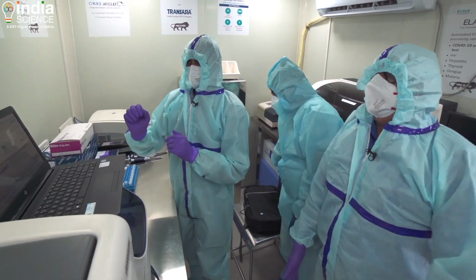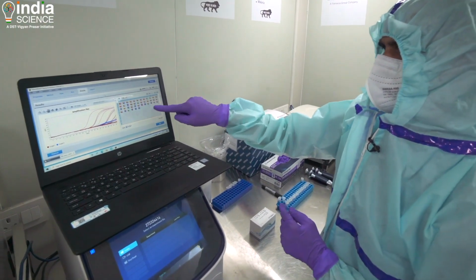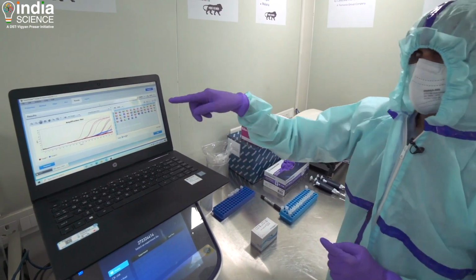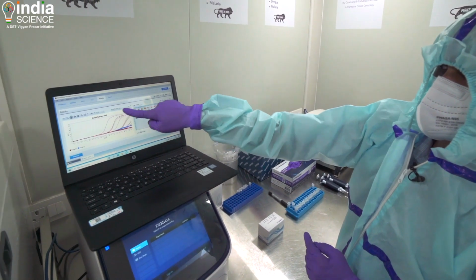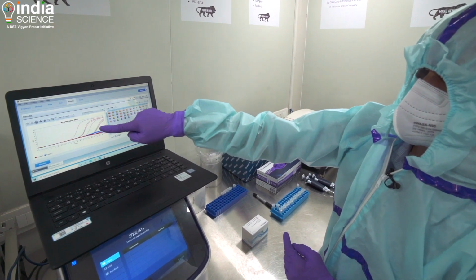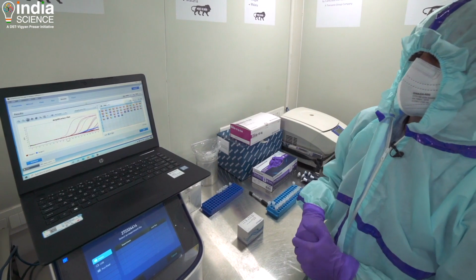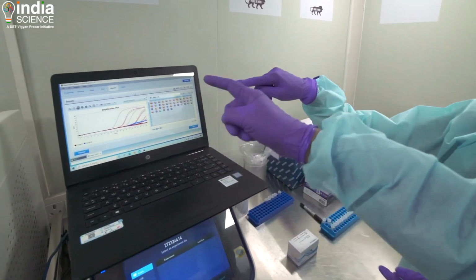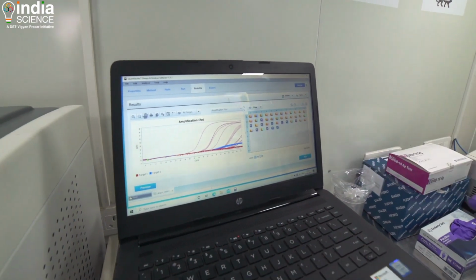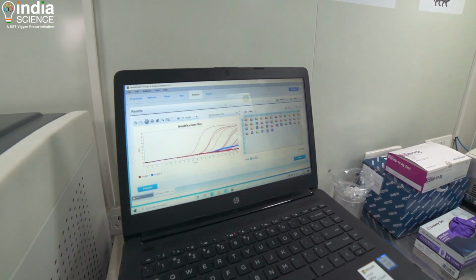This is how you see the results. This experiment had about 41-42 samples here. Whichever samples are positive will give us a clear amplification plot. We have close to 12-13 samples here which are positive. The ones going up are positive, and the ones below are negative. You set a threshold here, and anything above that threshold that shows a clear sigmoidal curve is considered a positive sample.